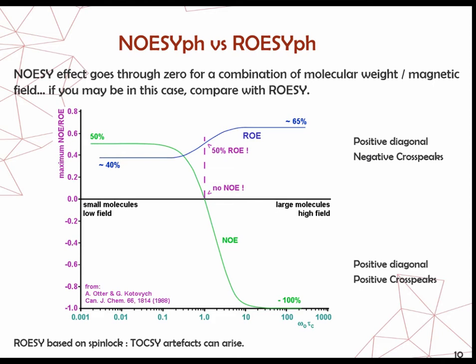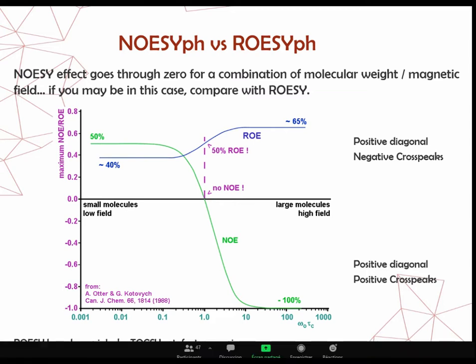No, it's a routine experiment. It's on the sample changer. So there's only the one NOESY experiment I can choose? Yeah, there's only one available. The NOE effect is not a big effect, so it's not very sensitive, so it's longer than a COSY or TOCSY experiment. So it's overnight, typically? Oh, no. If you have a 10 milligram compound, usually you will get the NOESY in 1 hour. But COSY in about 5 minutes.